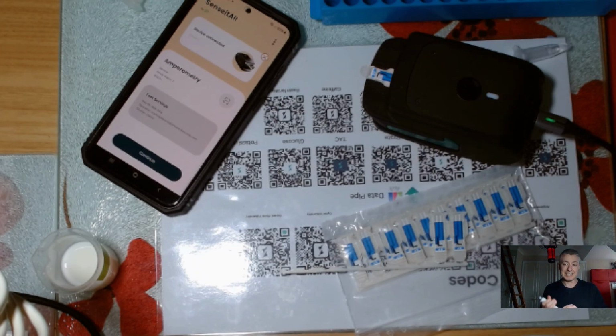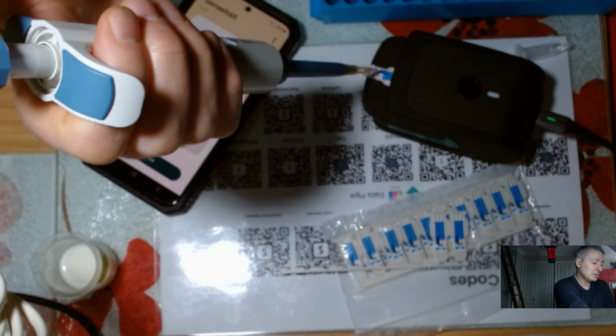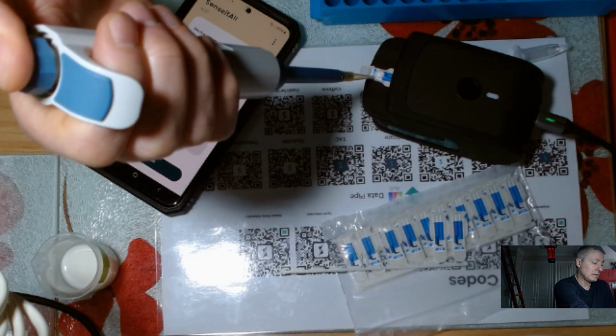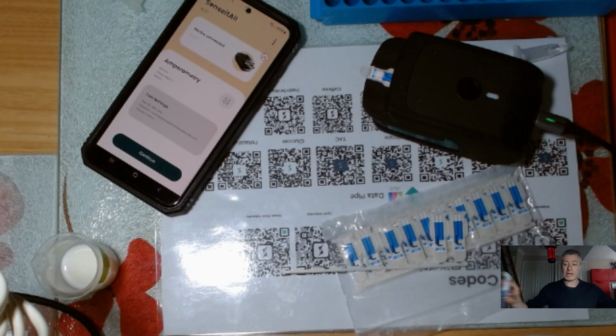So I'm going to take pristine milk, i.e. the one that I've not added any PAA to, and I'm going to put 50 microliters onto it, which I am doing here. I'll get myself a little bit ready, because I'm going to start an experiment to demonstrate how we generally have a signal for the peracetic acid in this particular assay. I'm then going to add a tiny amount of what I'm spiking with here.